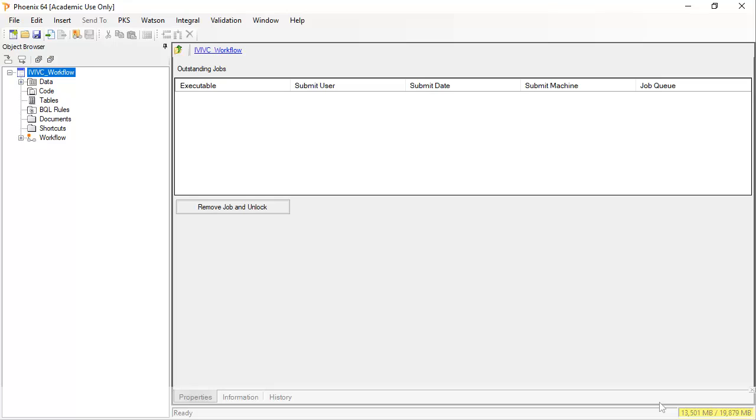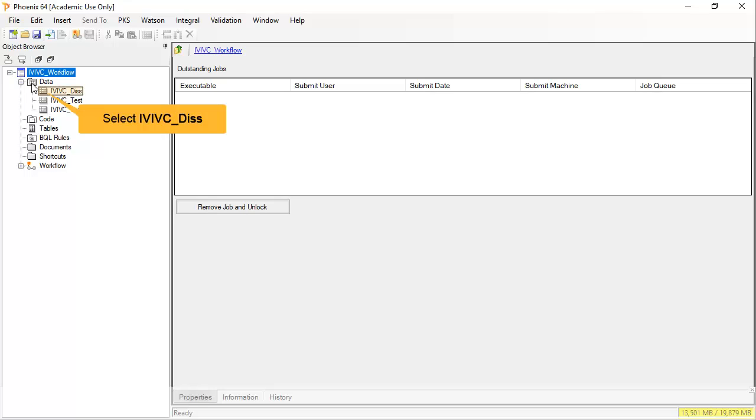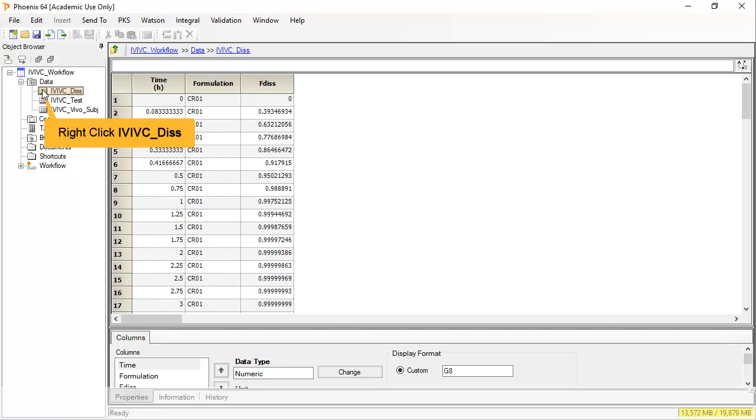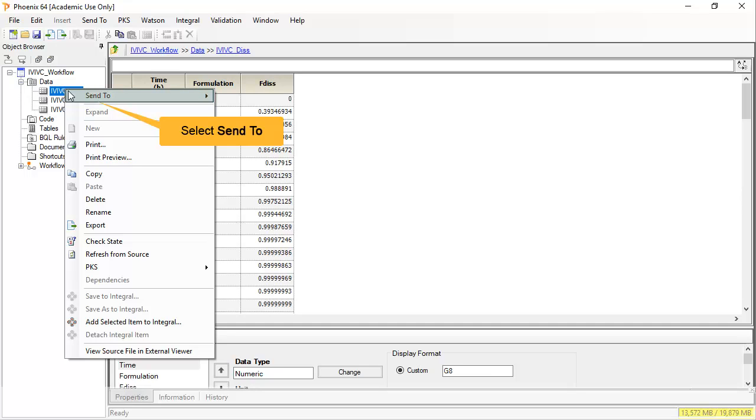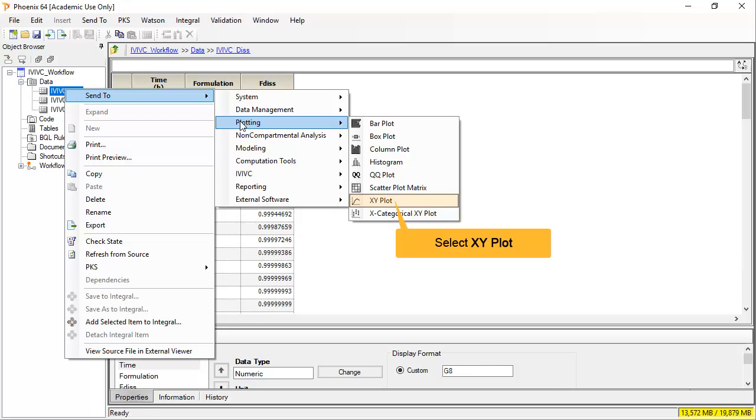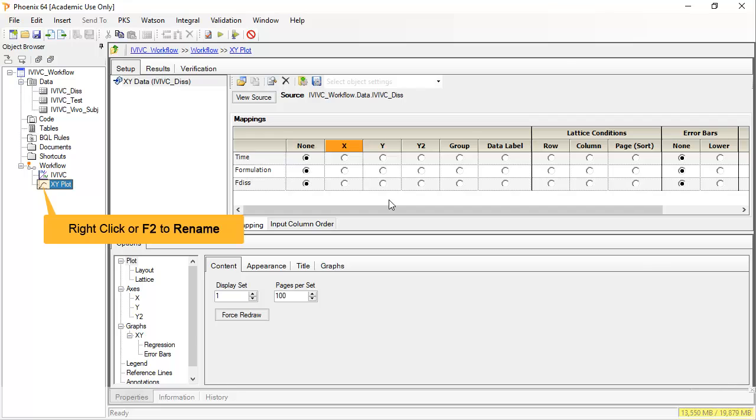Let me expand the data folder to show the data we will be using. I will select the IVIVC DISS worksheet which contains the in vitro dissolution data. To better visualize this information, I will right-click on the worksheet and send to an XY plot under the plotting menu. There can be a lot going on when building up an IVIVC, so I will rename the plot straight away.